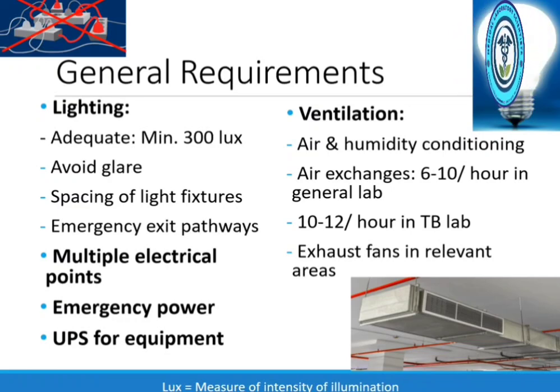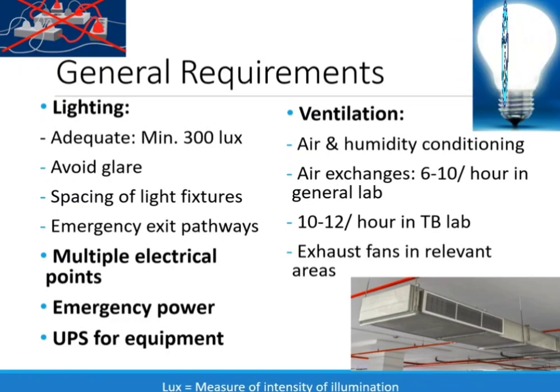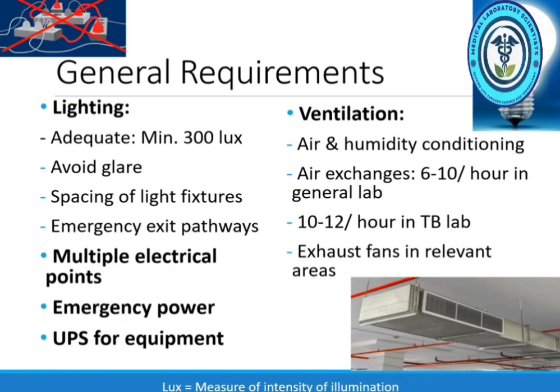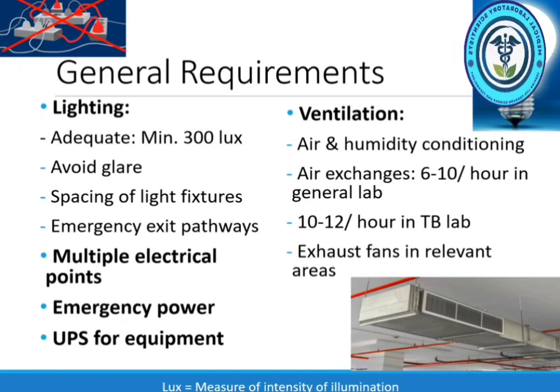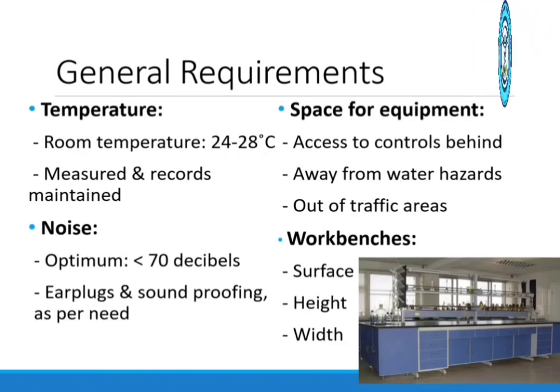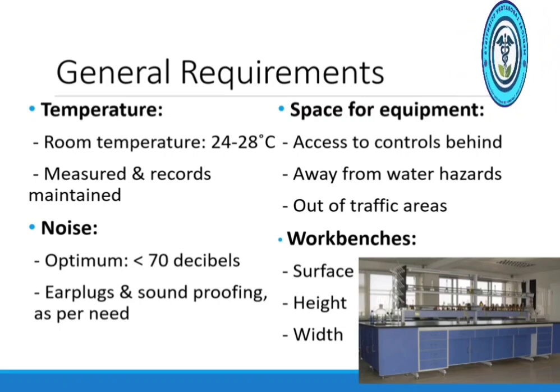Ventilation. The laboratory must have air and humidity conditioning. There must be 6 to 10 exchanges per hour in a routine diagnostic laboratory and 10 to 12 air exchanges per hour in a TB laboratory. Exhaust fans must be fitted in relevant areas. Temperature. The temperature in a laboratory should be maintained between 24 to 28 degrees Celsius. The room temperature must be measured regularly and records of the readings must be maintained.